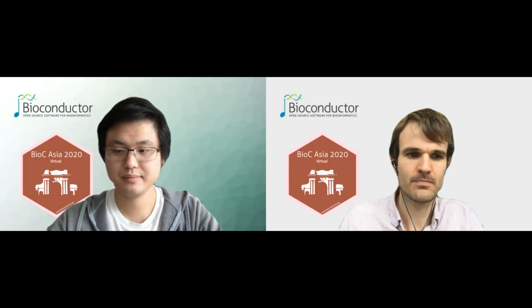Julie's got a comment. TrackViewer has functions for plotting methylation data too, so that might be something to look into also. Yeah, the main thing about this is that because it's in R, you can specify and loop through a whole bunch of different areas and save those plots out. Whereas with the more GUI-based solutions, you have to scroll through and do screenshotting and things like that. So hopefully this is easier for analysts.